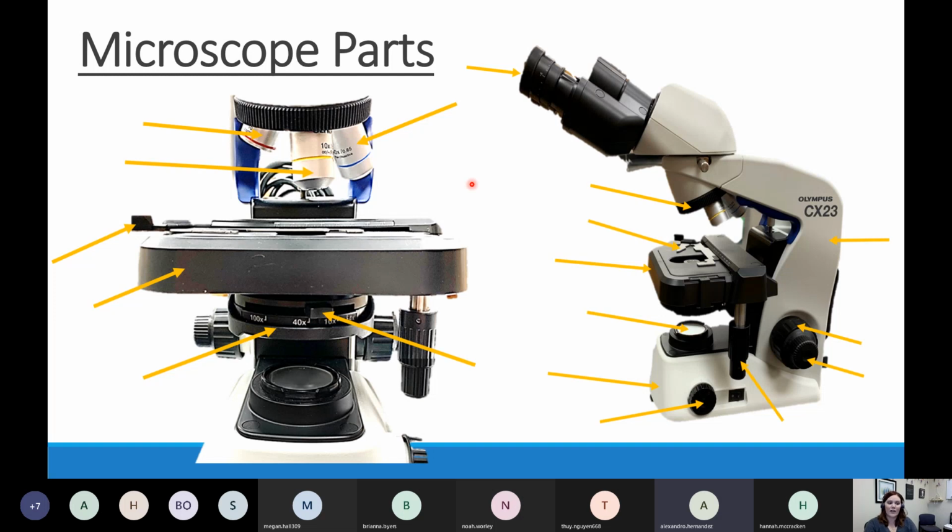Yeah, so Logan asked a good clarifying question about the difference between the coarse and fine adjustment knob. The coarse adjustment knob moves things a lot. The fine adjustment knob moves it just a little bit. And actually, here would be a good note that I want us all to write down. So let's find a place on your paper where you can write down a note, because this is, like Dr. Alla says, an underline, highlight, star idea, something important. Here's what I want everyone to write down to get us ready for next week with the microscopes.